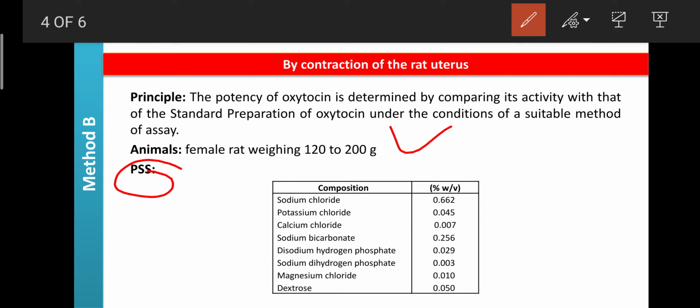They can be given to animals. These solutions can replace the blood. Blood gives the body electrolytes and ATP in the form of glucose. In the same way, these physiological salt solutions also contain glucose and minerals, so they can replace the blood. What blood can do, the same effect is done by these physiological salt solutions.